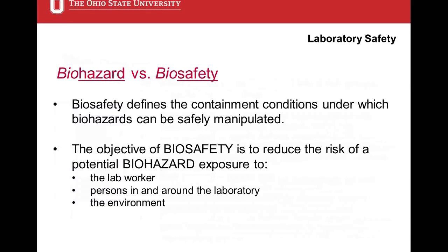These two words are not interchangeable, okay? Biosafety defines the containment conditions under which biohazards can be safely manipulated. So the biohazard is what you're working with. The biosafety is the containment, the equipment, the facilities that you work with to work safely. So the objective of biosafety is to reduce the risk of a potential biohazard exposure to the lab worker, to the persons in and around the lab, and to the environment.